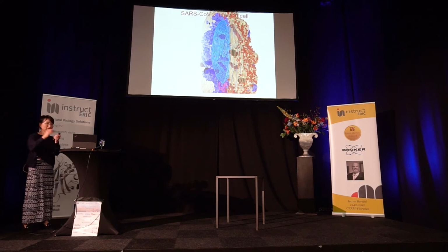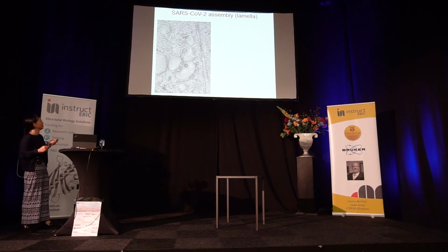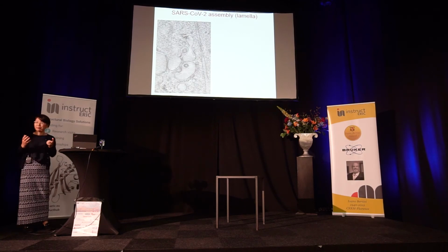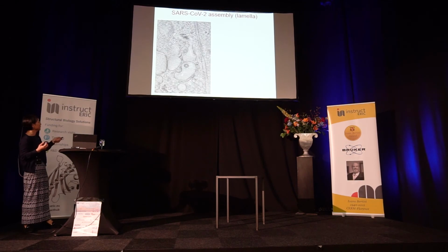Now we move on to the intracellular view, the cellular lamella. And what do you see? This is a movie slicing through a very thin lamella from a cell. This is where you see the nuclear membrane, nuclear pores. And this is the site where we captured SARS-CoV-2 just being produced, assembled and budding into what we also call a single membrane vesicle. You can see there's a virus particle here and another particle just being assembled here.